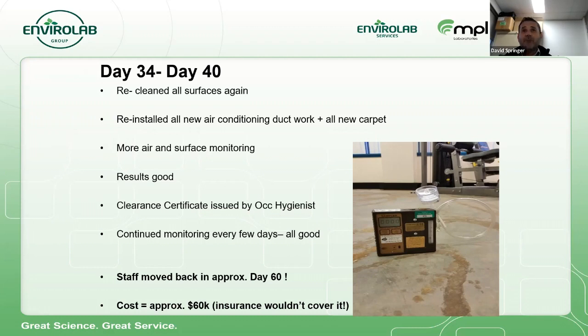And finally, the results were looking good enough for our occupational hygienist to issue us with a clearance certificate on the condition that we continue monitoring every few days for the next few months. So day 60, so 2 months later, our staff were able to move back into that laboratory. All up about $60,000 worth of just things that we threw out and analysis and hygienists. And unfortunately, insurance didn't cover anything of that.